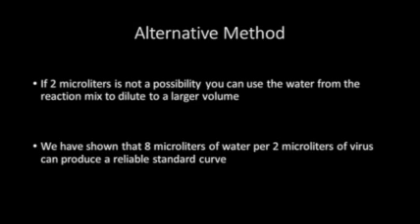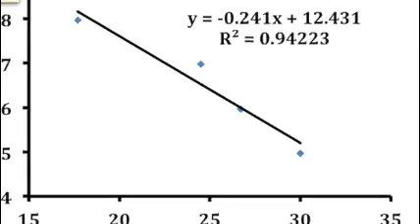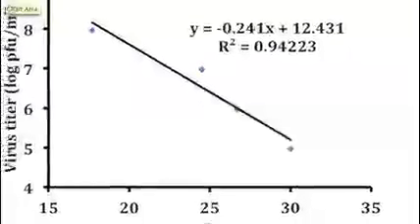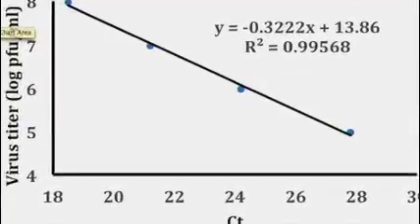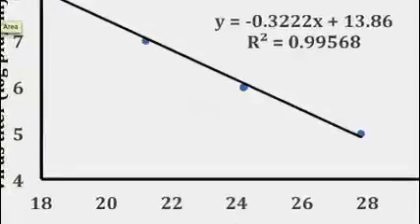So one alternative method we can do is you can dilute your virus in water, and you can try that. And all this is showing is the old technique R-squared value on the left and the new technique R-squared value on the right. And you can see the new technique has a high R-squared value.